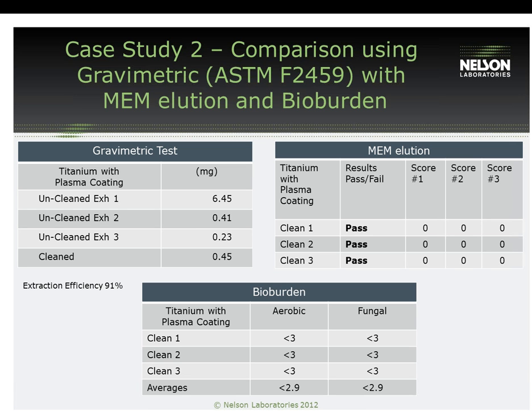What that means is that the test method and solvent chosen were able to remove 91% of the surface residues. So that's a great control to include with the test method to show that it is working and we can detect the residues that are there. And then they tested a clean sample with milligram amounts of 0.45.